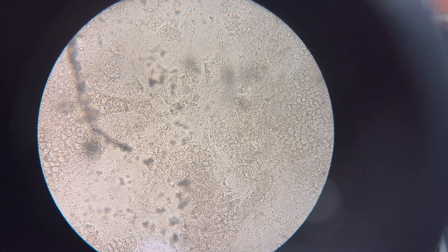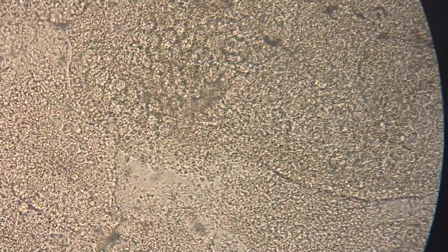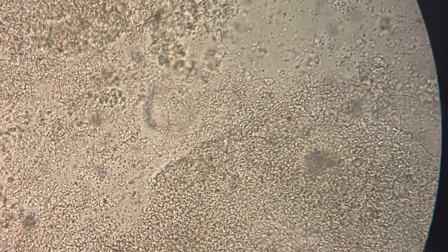I don't expect to find anything, but it's a good time to check anyway. So far the first two slides are totally clear. I'm making my way systematically across the slide — I'm not going fast. In any areas where I see shadows or maybe an air bubble, I zoom in, focus, and look through the mucus layer to see if I pick up anything.